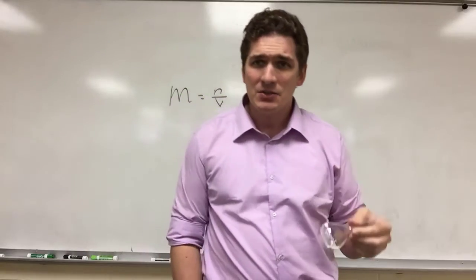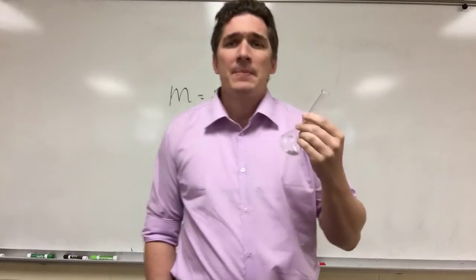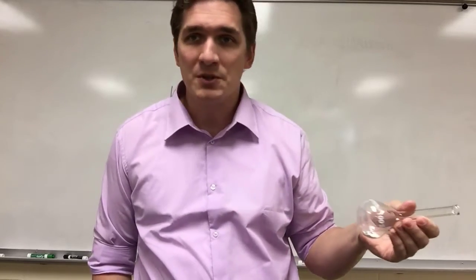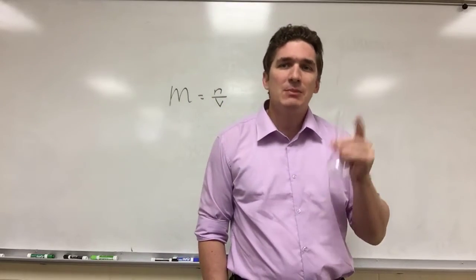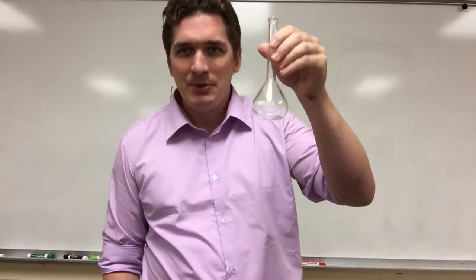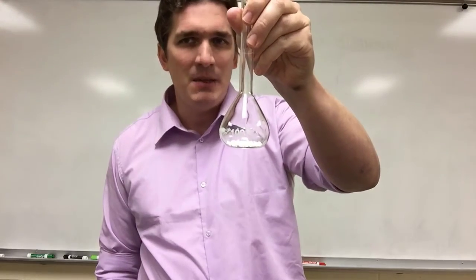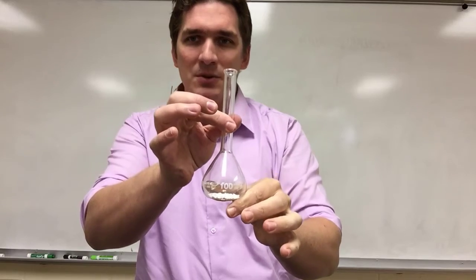So if you see a concentration written for something like 1 molar, 12 molar, 10 molar, 3 molar, that means there's a certain amount of this solid dissolved in water or dissolved in some solvent. More generally, there are all types of solvents, but most commonly you're going to be working with water. So if you see molarity associated with a concentration of something, the solution is not pure whatever that compound is. And so this was meant to be a 1 molar calcium chloride solution. This is all the mass it takes to make that. This is not 100 milliliters of calcium chloride you're working with.